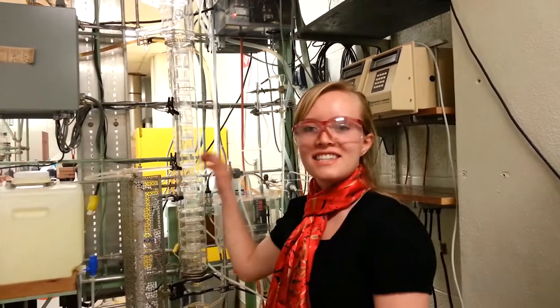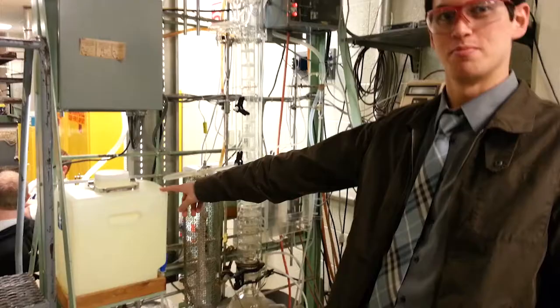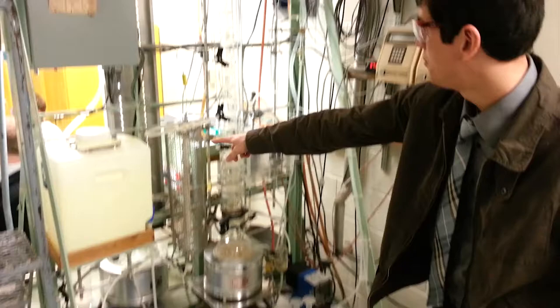This is the continuous distillation column and we're separating methanol and ethanol. Here's how the column works. The feed tank is here with methanol and ethanol. It pumps down and up to feed tray number 10.